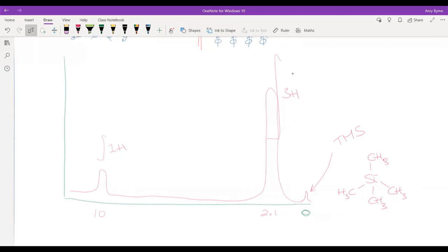So I would say that this is either CH, so these hydrogens with a CO, but I have 3 hydrogens, so I would suggest that this last connection here is another hydrogen. So this is a CH3, maybe. Let's see what the other peak tells us.